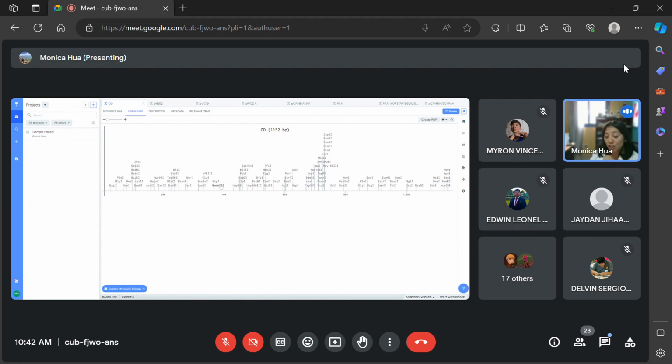You have to make sure that the enzyme you choose does not cut your DNA sequence. If it does, then you will have a non-functional protein, or it's not going to be transcribed if you cut off the ATG, or it's going to have what we call a premature stop codon. Don't cut your DNA.